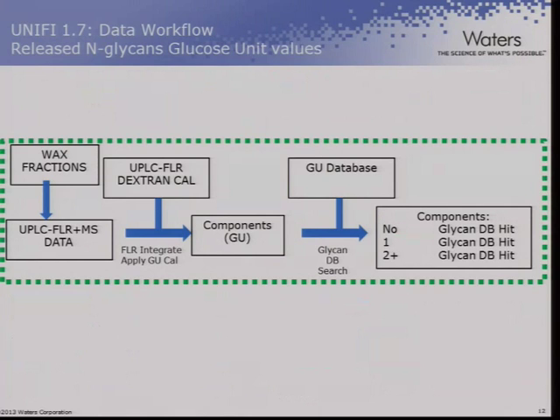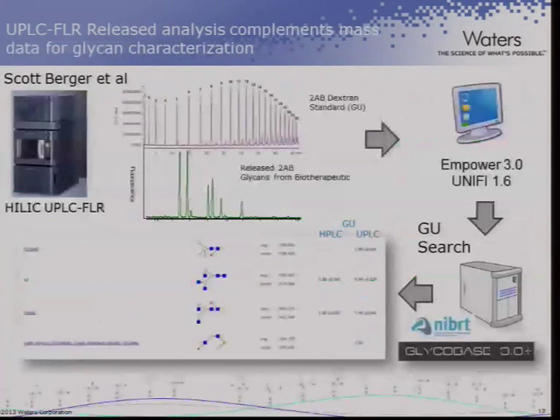And so you get a number of hits, and then in each peak you'll probably find 2 or 3 structures that could be in that peak, or even more. And then the question is, how are you going to distinguish which of those preliminary structures is actually in your peak, or which of those preliminary structures are in your peak, because some peaks will contain several structures.